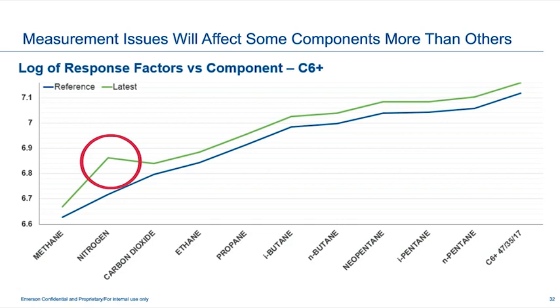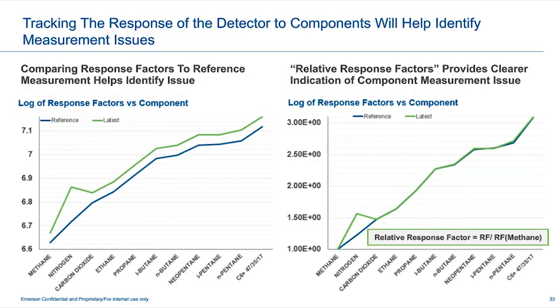Now in this particular case, this kind of goes back, if we looked at one of the specifications, this would be your sample system in terms of we have a nitrogen leak. Nitrogen in the atmosphere is a higher percentage than generally in a C6 application. And so that leak would actually show up as a high peak for the nitrogen. So we can kind of see the peak, and it does show up when we're looking at the response factors. And one thing I should note too, it's not the response factors that we plot, it's the log of the response factors that we plot.